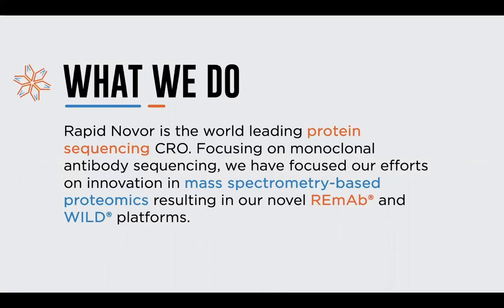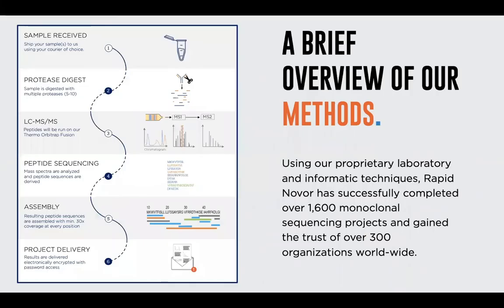And how do we go about it? Well, we follow a fairly standard proteomics workflow here, at least on the face of it. We take that sample that's been sitting in the back of your fridge for years and years, and you're very careful not to use too much because you're never going to get any more of it.